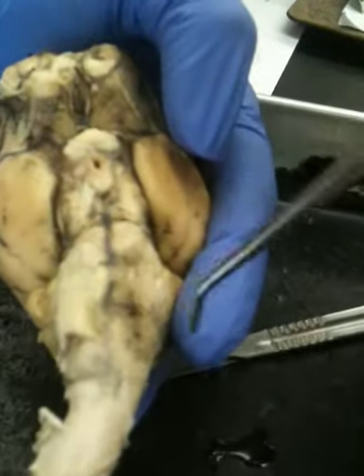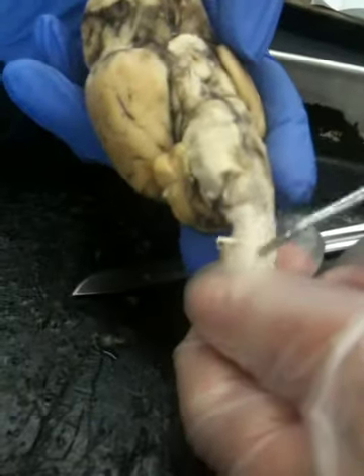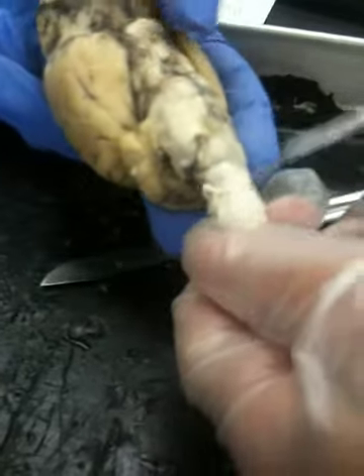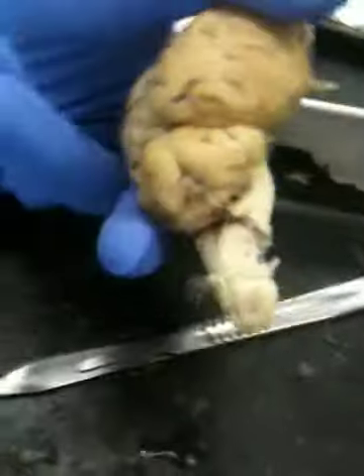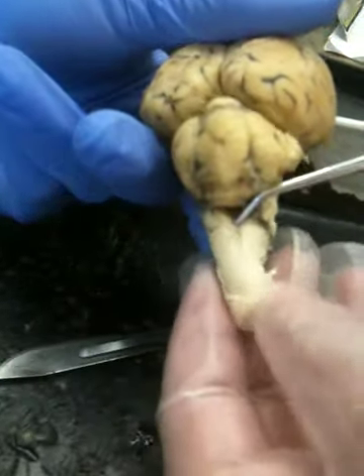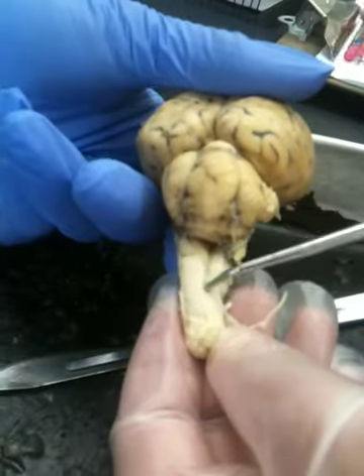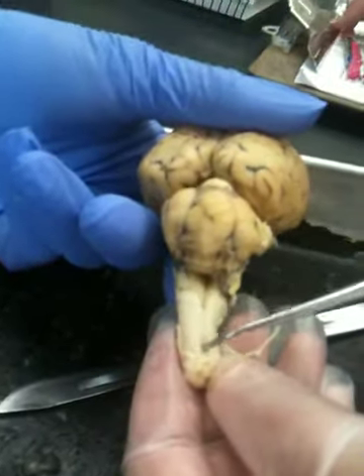Okay. The medulla oblongata also turns into the spinal cord once it leaves the brain. And there is a ventral median fissure, which I believe you can see a little bit more clearly right here. Yes, on the medulla oblongata. Now we will cut. Wait!